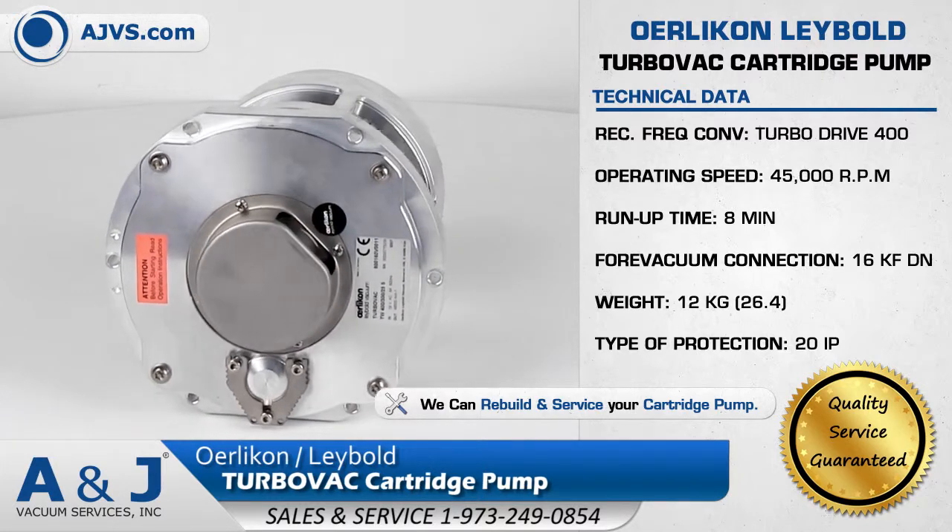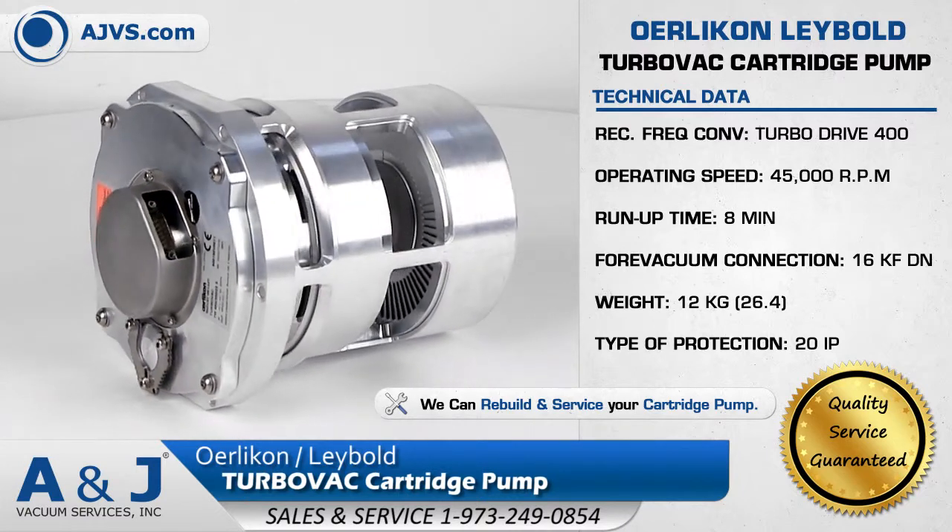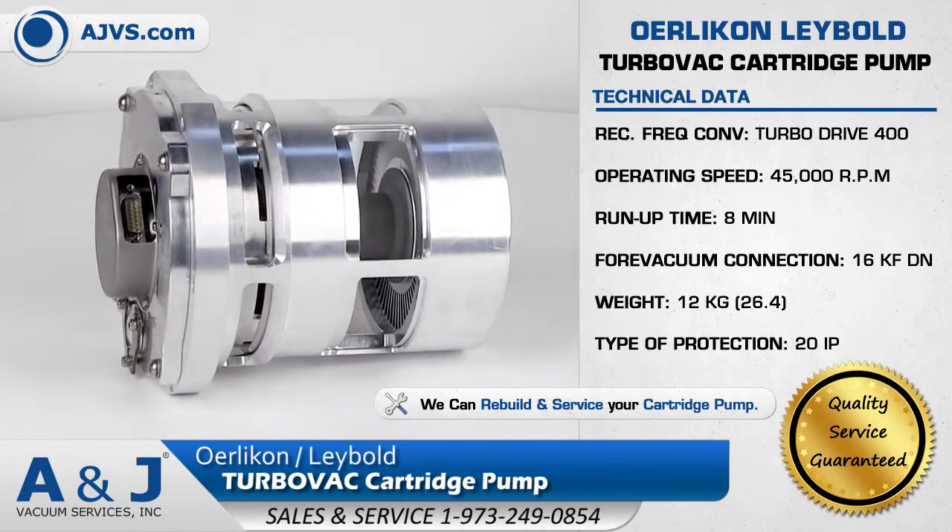The innovative and cost-effective design of the Oerlikon Leybold TurboVac Cartridge Pump provides easy installation, maintenance, and servicing.